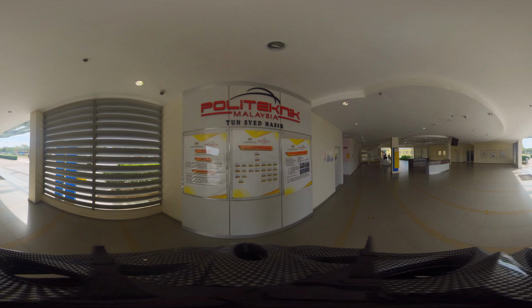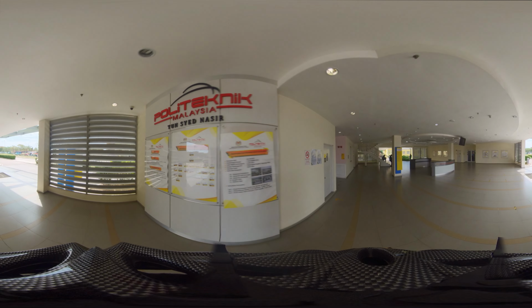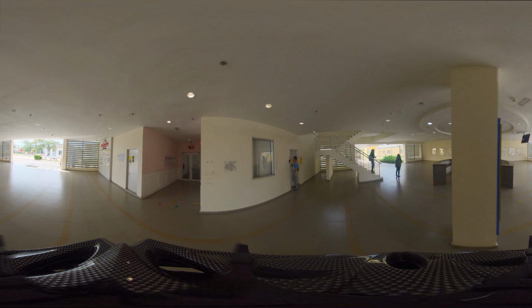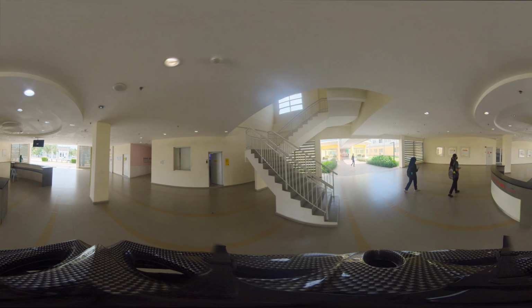Welcome to Polytechnic Tun Syed Nasir Syed Ismail, where we begin a crucial journey to understand food safety audit in food processing area. Today, we'll be exploring the food processing laboratory to identify common hazards that could compromise food safety in the food production line.